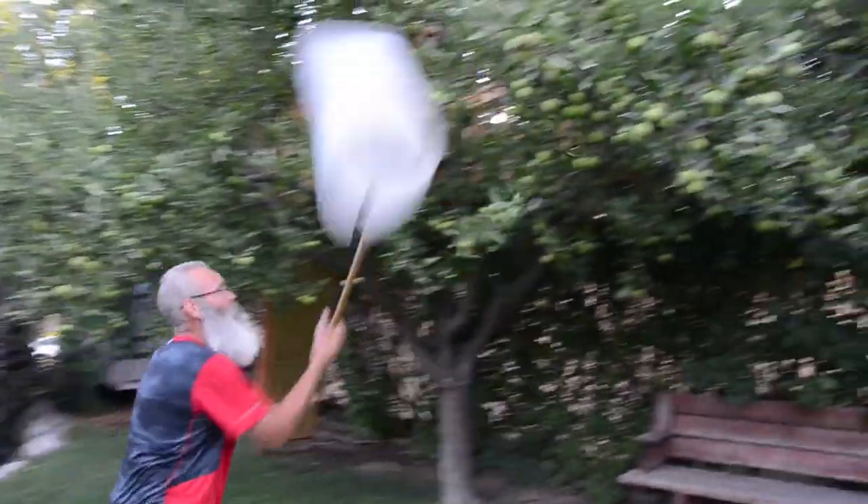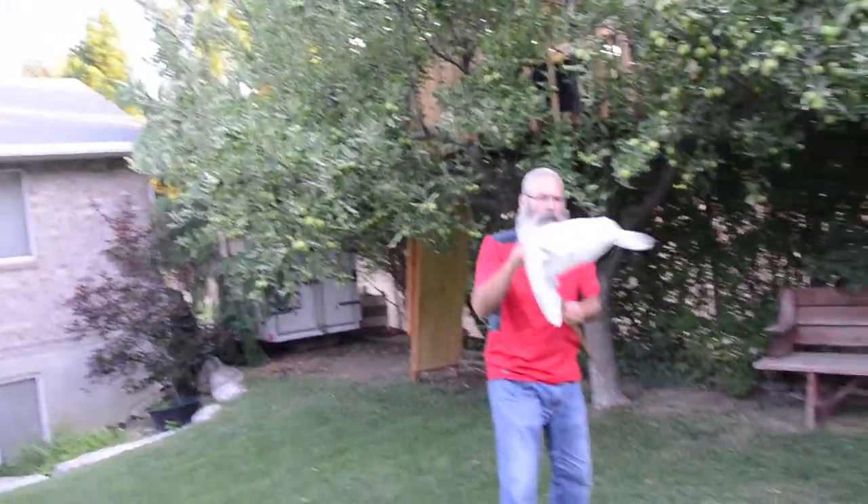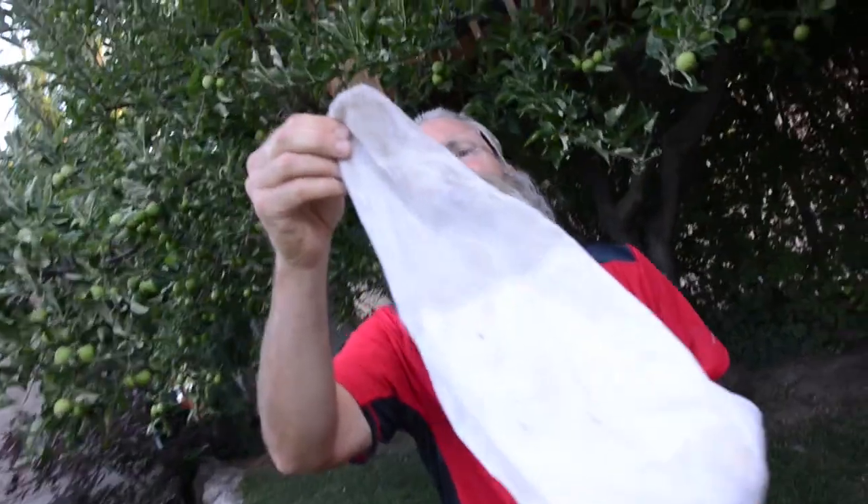Look, did you see that? Dang it, I missed it! But you know what? I have a few more over there that we could pin today and help you get ready for your insect collection. I'm not as fast as I used to be, and sometimes they do get away. But that was an awesome Ichneumonidae. I do have a couple more over here that we can look at and practice our pinning. Let's go do that.